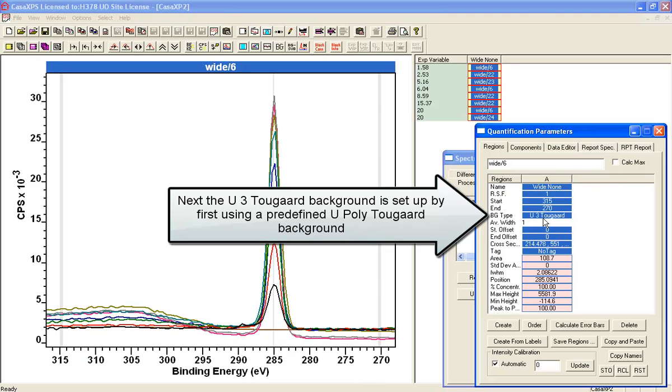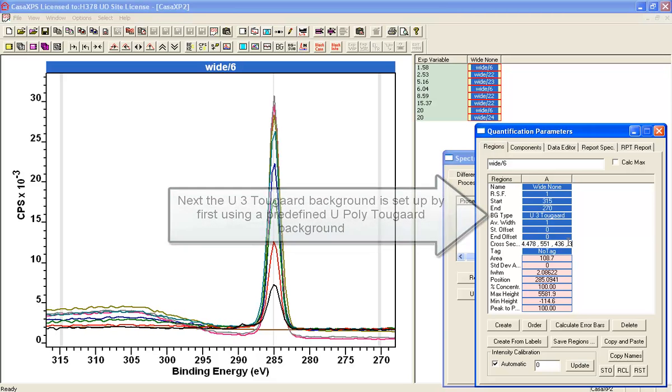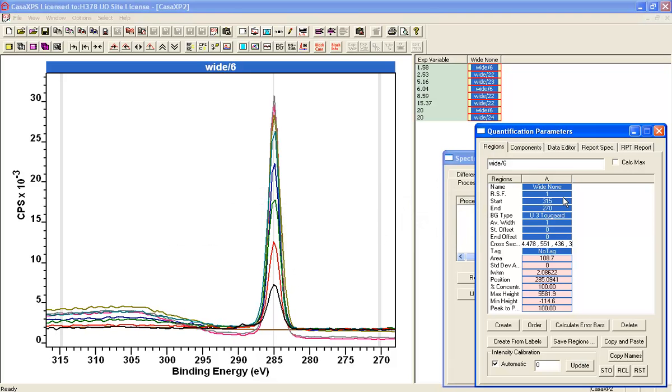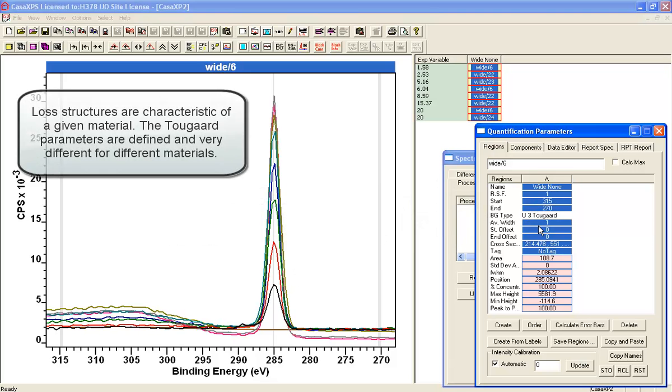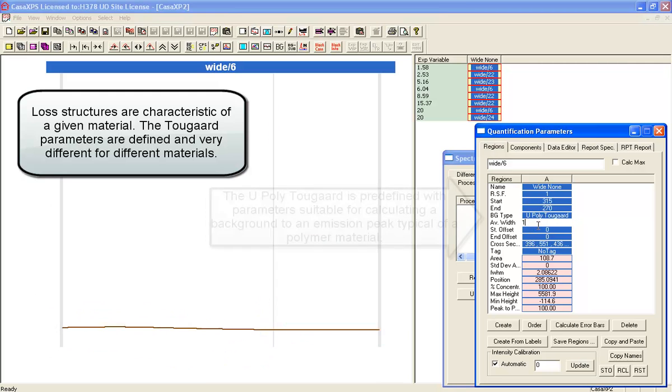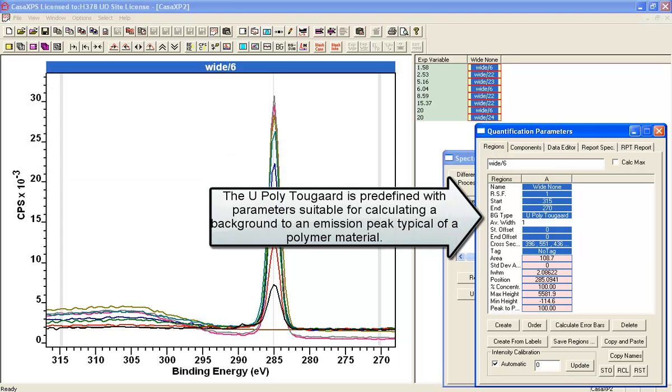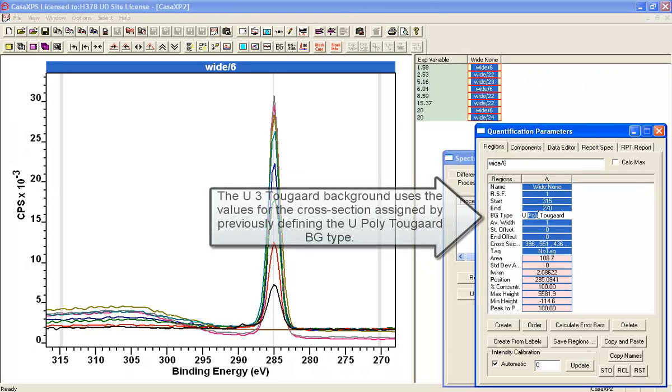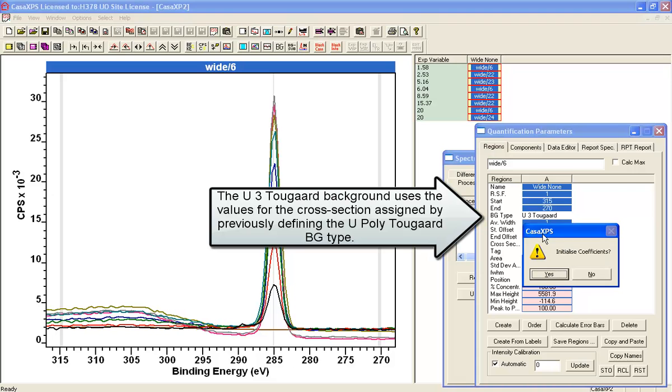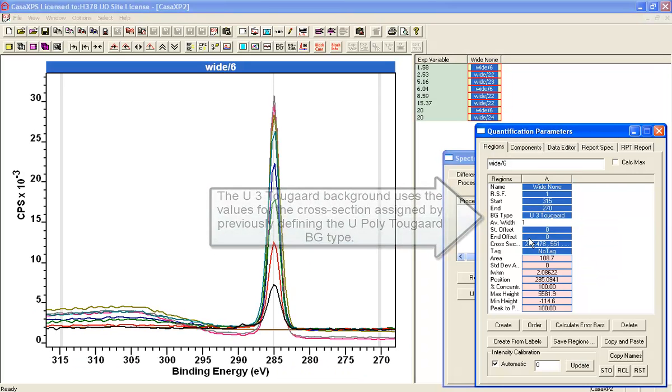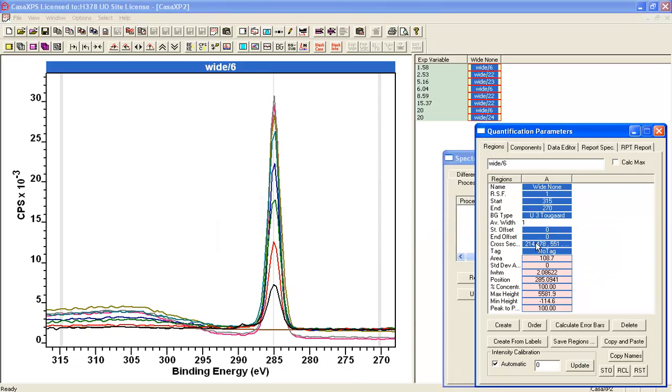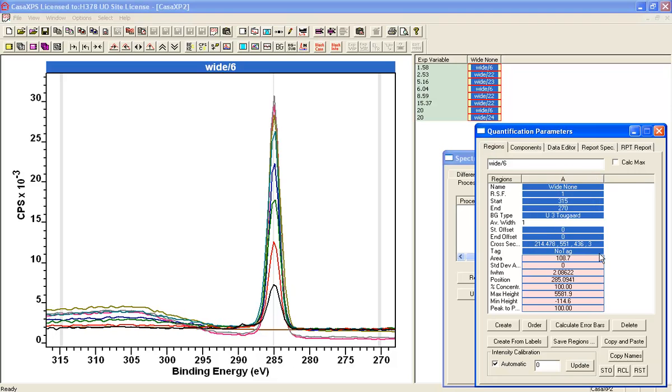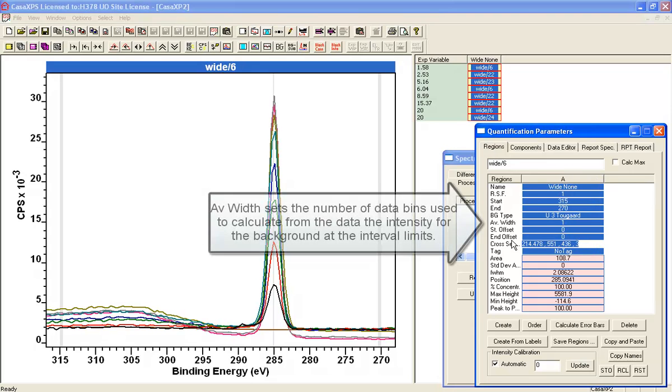But the U3 2GAR doesn't really have any predefined parameters that will work for this particular type of data. And we have a poly form of the 2GAR background which is predefined. If I set that first, that's going to give me a set of parameters. And if I return it to U3 2GAR background type and I don't want to initialize the parameters, I've now got a background which is defined by the poly one in terms of these four coefficients here that it was previously set up for a material.